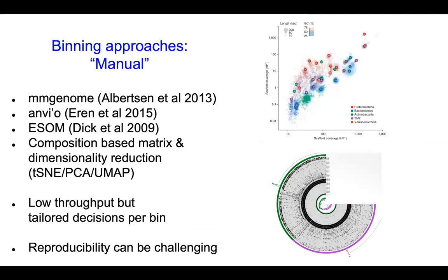This was originally developed as a binning and visualization platform, but has now sprawled into a multifunctional bioinformatic powerhouse, and I encourage everyone to try and learn it. We will cover it in much more detail in a later lesson in metagenomics.